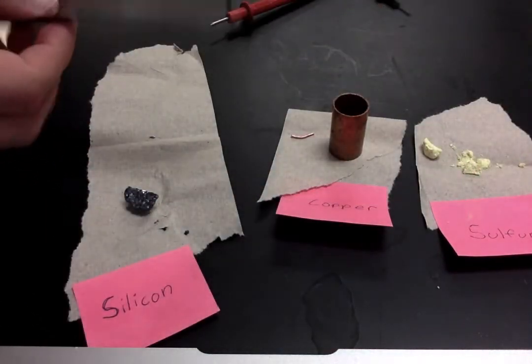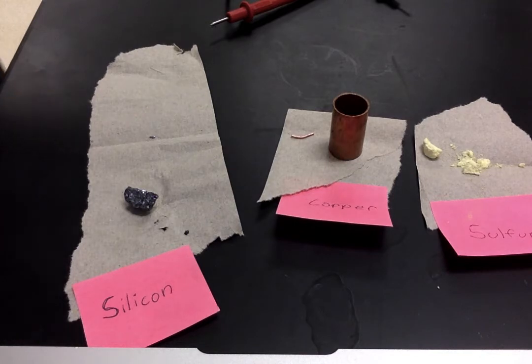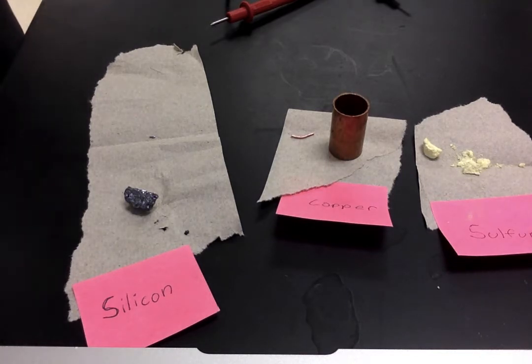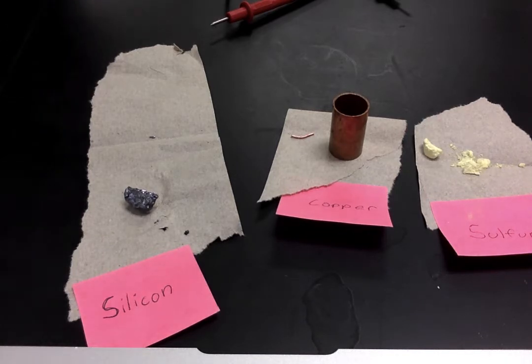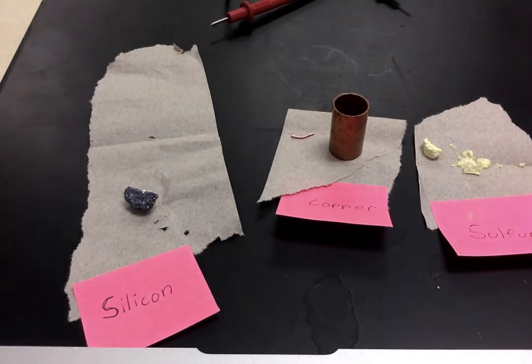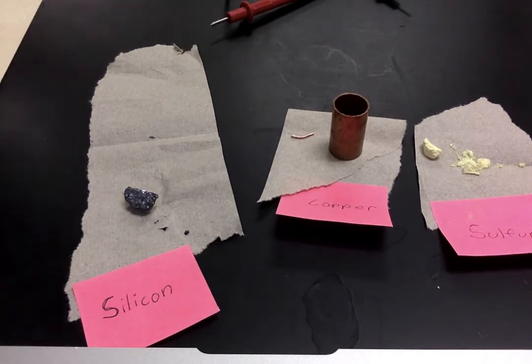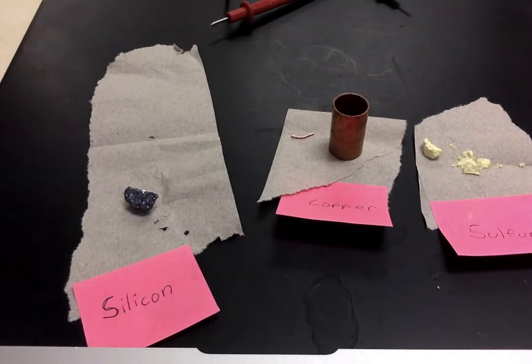And so what you should have seen is one of them didn't break apart at all. One of them broke apart a little bit, and one of them broke apart super easily, like I hardly even had to press on it. So the one that didn't break at all, you're going to rank that one as the most malleable, and the one that broke the easiest, you're going to rank that one as 3, the least malleable.